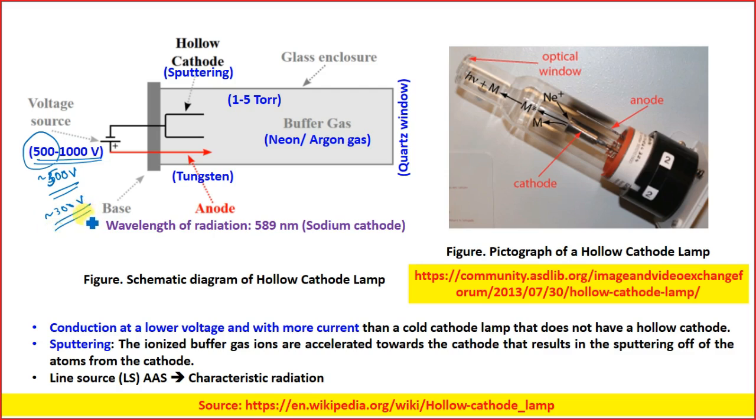Some manufacturers have reported that the voltage source is around 300 volts. So usually it varies between 500 to 1000 volts.